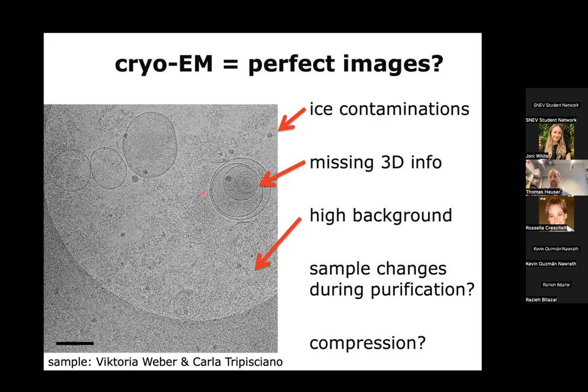Yeah. We also have the problem that we're not working with liposomes where we just add a few things together in a test tube, but many of our samples come from very complex media to start with and have a very long and complicated purification. Therefore, there's no way around having lots of background from our sample.